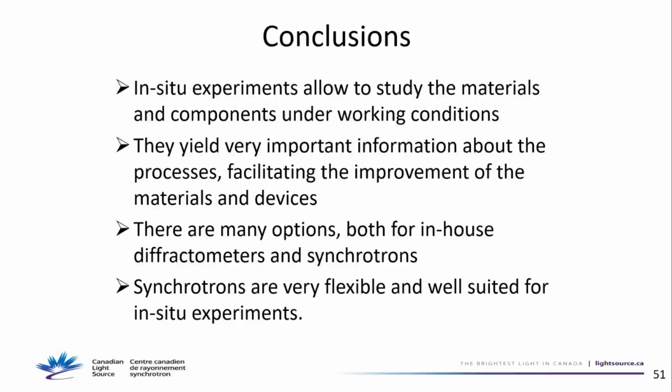So I will quickly wrap up and reach the conclusions. In-situ experiments give you a whole lot of information about your sample under working conditions. You want to make better materials with a certain application in mind. You can decide what you want to control during your measurement. Is it temperature? Is it gas? Is it stress or strain or current? And apply that during your experiment, and try to come up with a better material in the next iteration. Thank you.